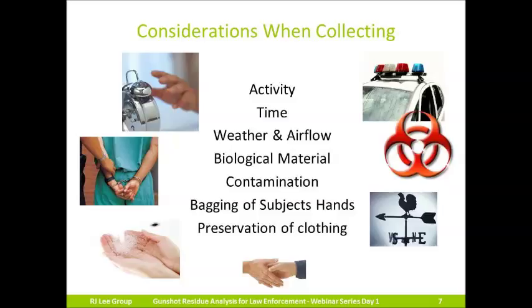It is not uncommon to find only one or a few GSR particles on a case sample, and you do not want to be a possible source of these particles. As I stated previously, if collection cannot be done at the scene, it is highly recommended that the subject's hands be bagged before being cuffed. This is done to prevent any contamination from getting onto the subject's hands.